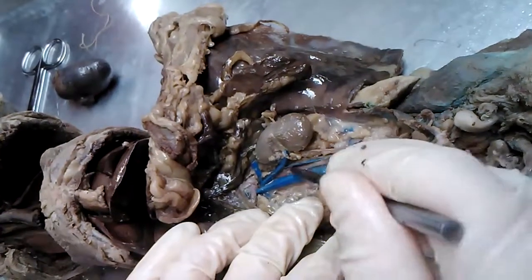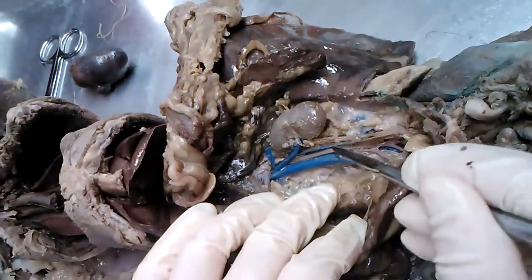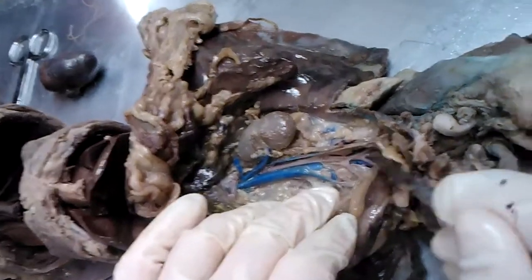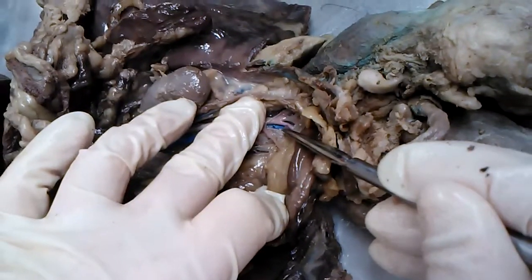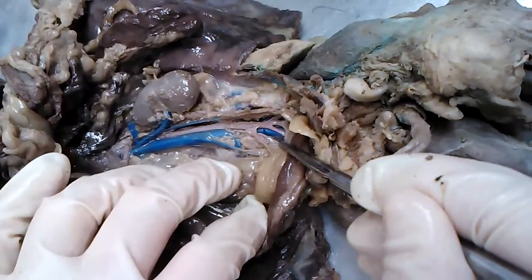A couple big arteries and veins here. Look at this huge vein, nice big and blue there. That's the inferior vena cava. The artery right beside it is the abdominal aorta. Down here we can see where the abdominal aorta branches. See these two branches right here? Those are the two external iliac arteries, left and right external iliac. Right behind them are the external iliac veins that have the very same name.